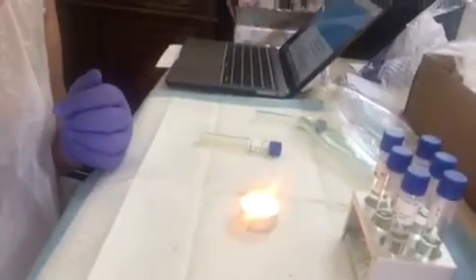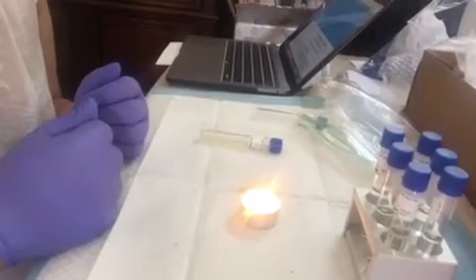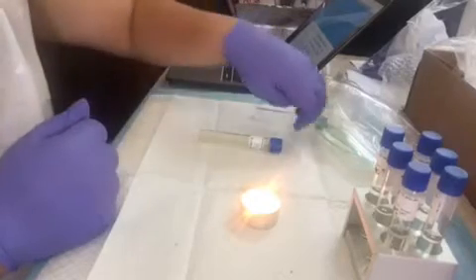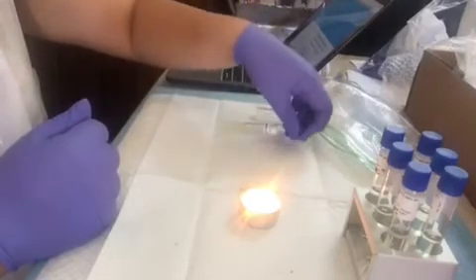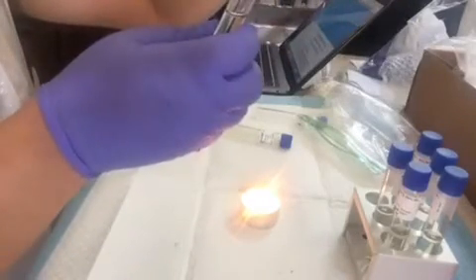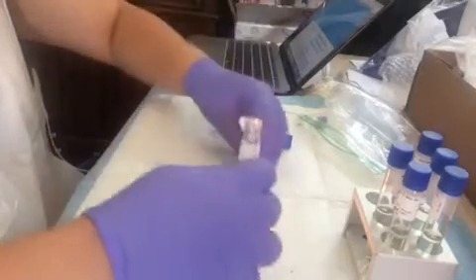Alright, so let's get started with the lab testing. Hello, it's Marianne Vertiflor. Today we are doing the testing on environmental influences on microbial growth, salt tolerance, and pH testing. So first, we have the nutrient broth with the 15% normal saline. I'm going to flame it through the lip.